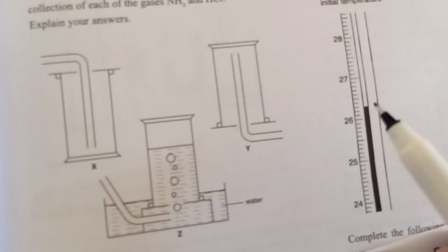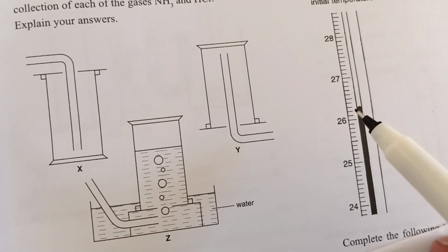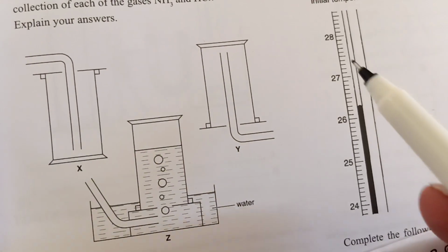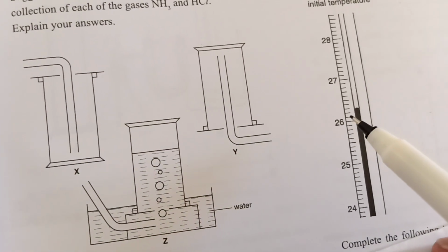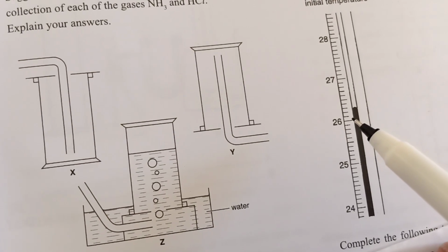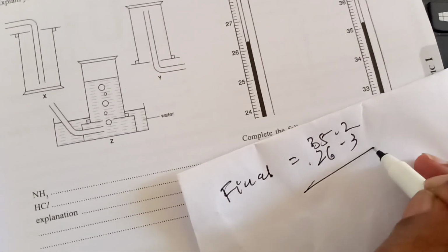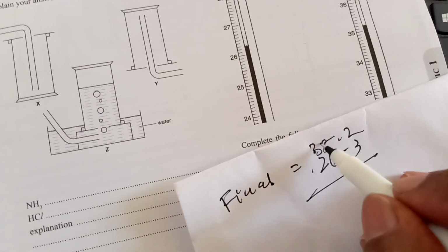Initial temperature is 26, 27, 26.1, 26.2, 26.3. So it is 26.3.